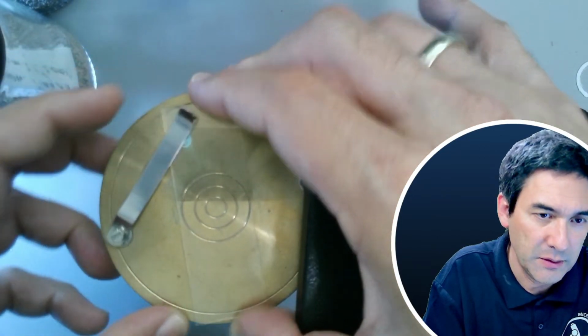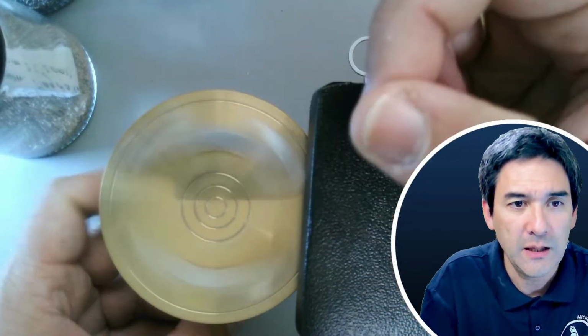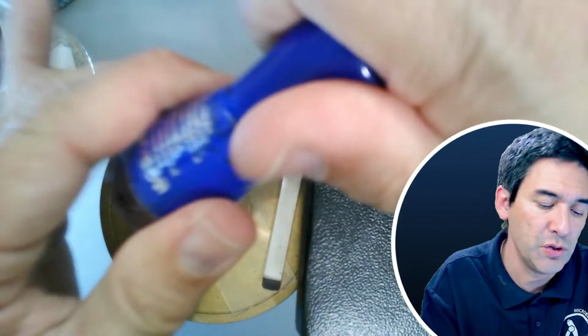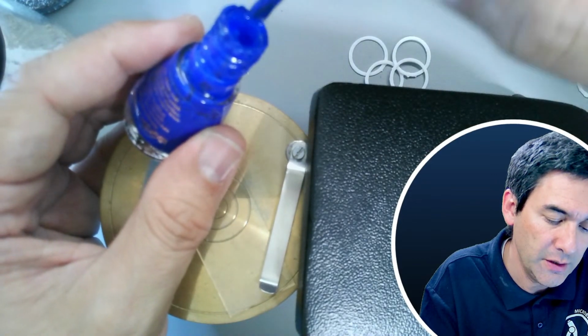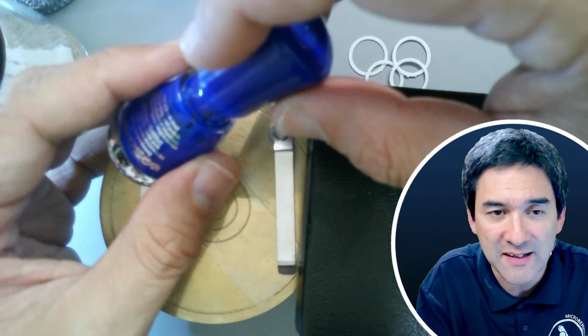So I'm going to clip this one on here, and this one on here. You are able to rotate this now. I take some nail polish. I'm using blue because blue is a nice color and it's easy to see. The contrast is good. Make sure that it is sufficiently liquid. If not, you have to add a couple of drops of acetone.